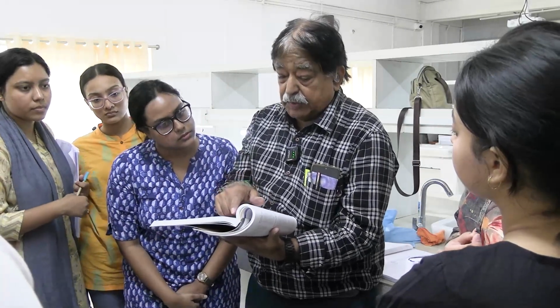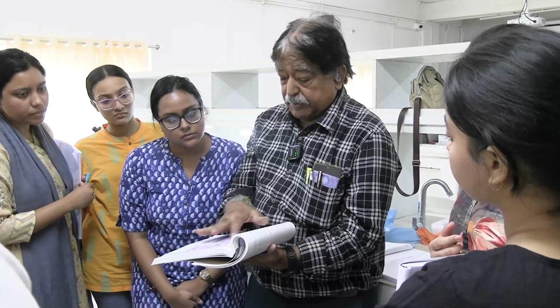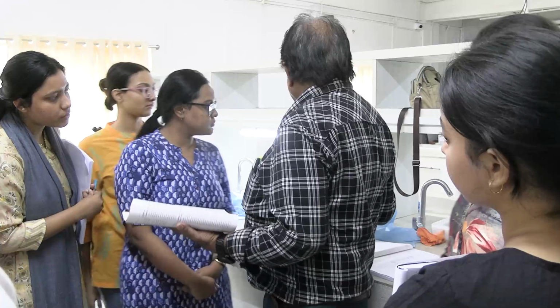But you have to put a legend. Legend means what is this slide? Photo, figure 1. You say that it is this slide, the spleen or kidney or something like that. Photomicrograph. Now see the photomicrograph. If I take a picture with a photomicrography setup, camera and setup, and then click, then this type of picture will come. This is a hand drawn one.